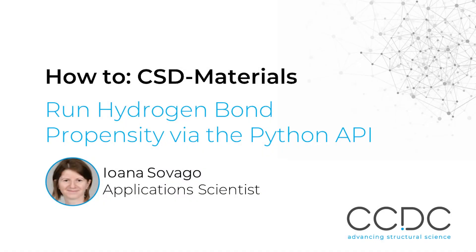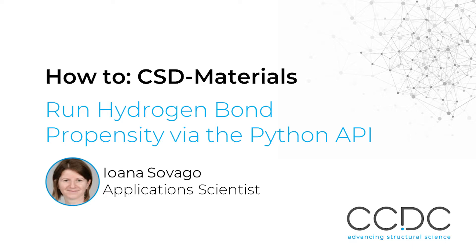Hello, my name is Ioana Shovago and I'm an application scientist at CCDC. Today I'm going to show you how to run the hydrogen bond propensity tool using the Python API. This is part of a co-crystal design workflow in CSD materials. Let's get started.